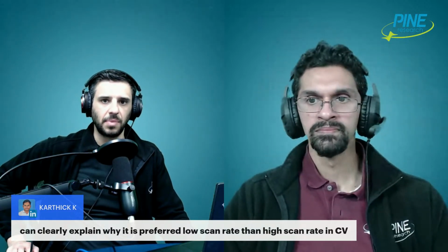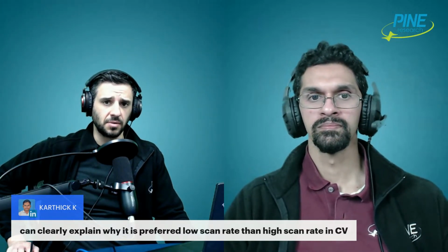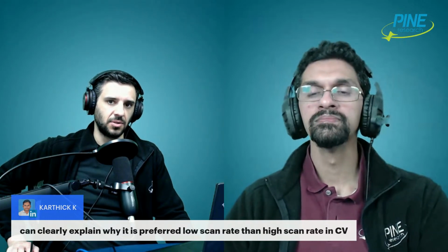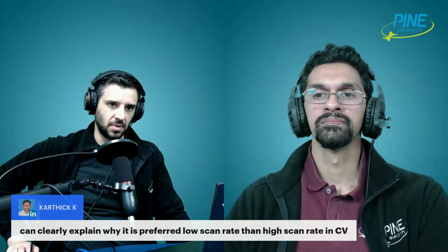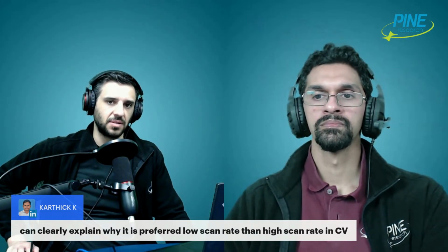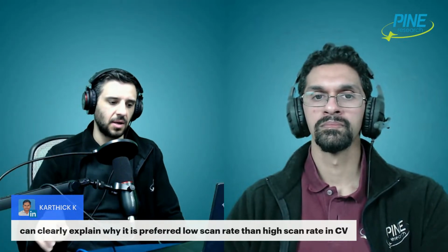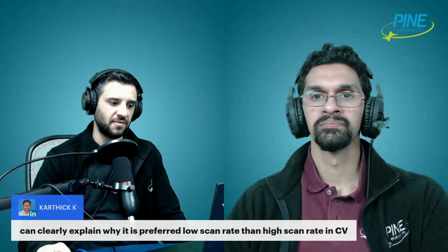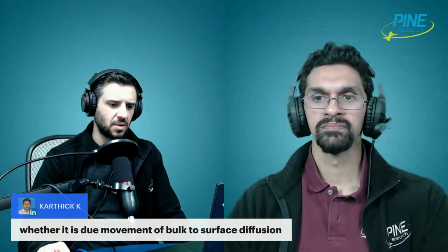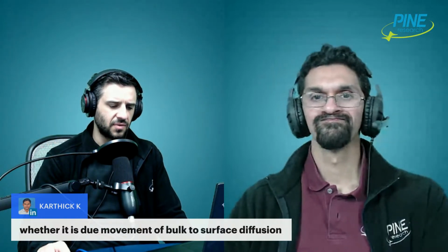And so one of the things that people do sometimes is LSV at a really slow scan rate. Sometimes for corrosion experiments, they do something like this to isolate the hopefully kinetic current so you can make Tafel plots. And so that's one reason to scan slowly, but it isn't as though you can't scan fast and get information. So the follow-up is whether it's due to movement of bulk to surface, diffusion.